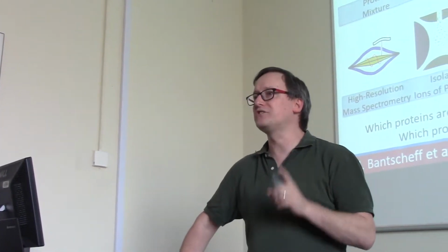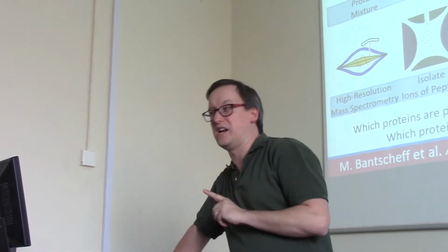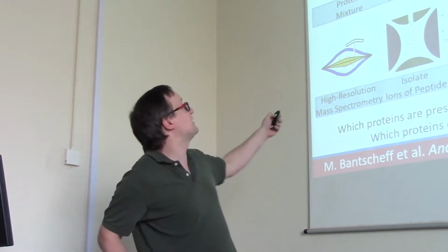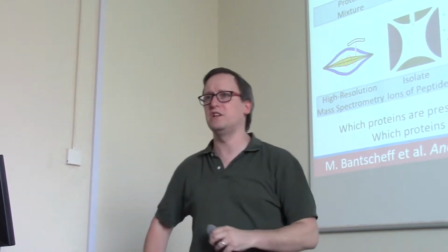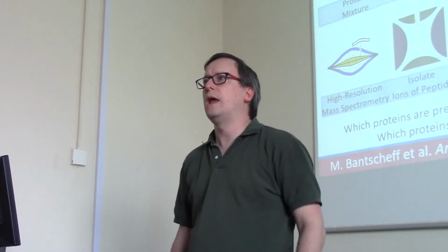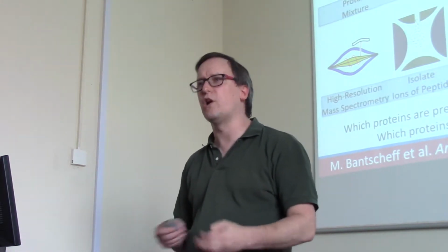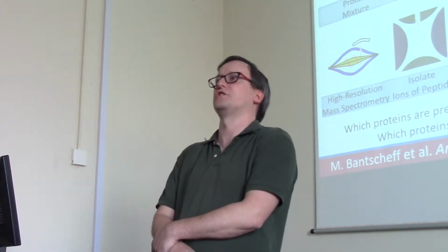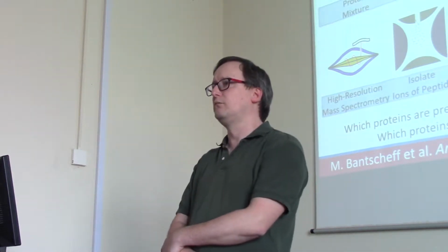Typically, biologists don't care tremendously about peptides, but they do care about intact proteins. So at the start, I see that we have a protein mixture. If I blow up a bunch of tissue, how many proteins are there in a given proteinaceous tissue? Maybe it's muscle.